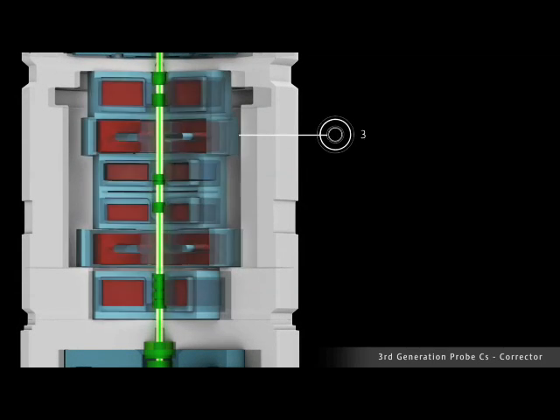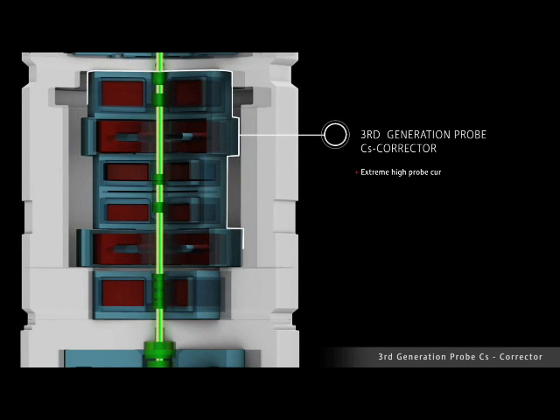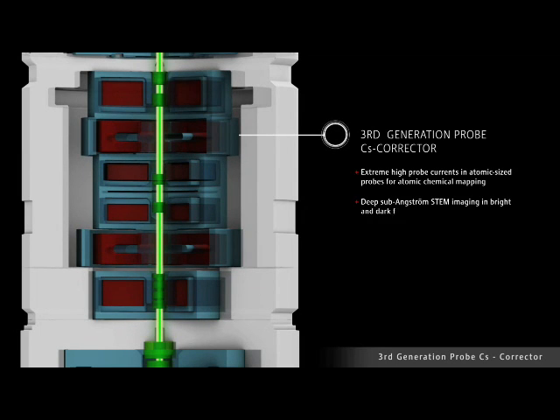The D-core probe CS-corrector enables extreme high probe currents in atomic sized probes for atomic chemical mapping and deep sub-angstrom STEM imaging in bright and dark field applications. Atomic resolution imaging and chemical mapping across the large high-tension range of the Titan is achievable with optimum results for different materials with this technology.